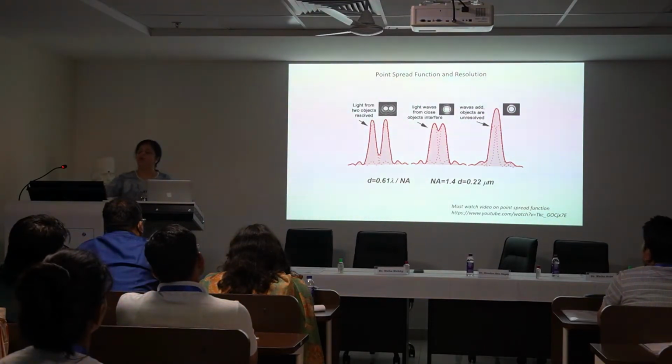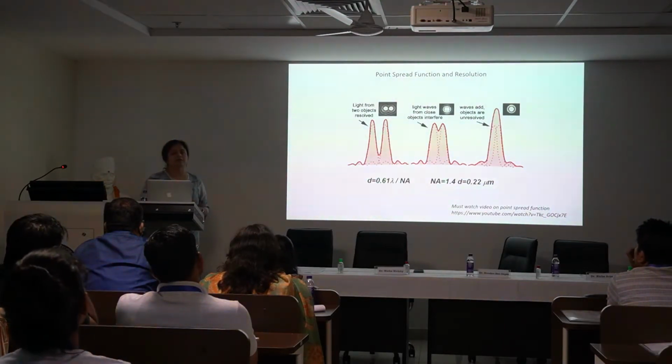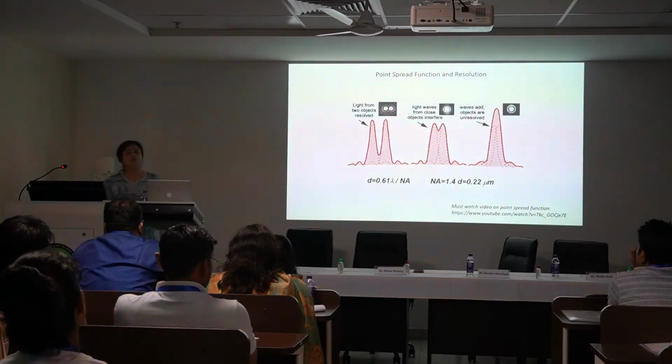If you think of how many GFPs can fit in this 200 nanometers, it is a huge number. Hundreds, let's say, can fit in this 200 nanometers, depending on which kind of three-dimensional orientation it is. So now we are not able to localize this better than that 200.